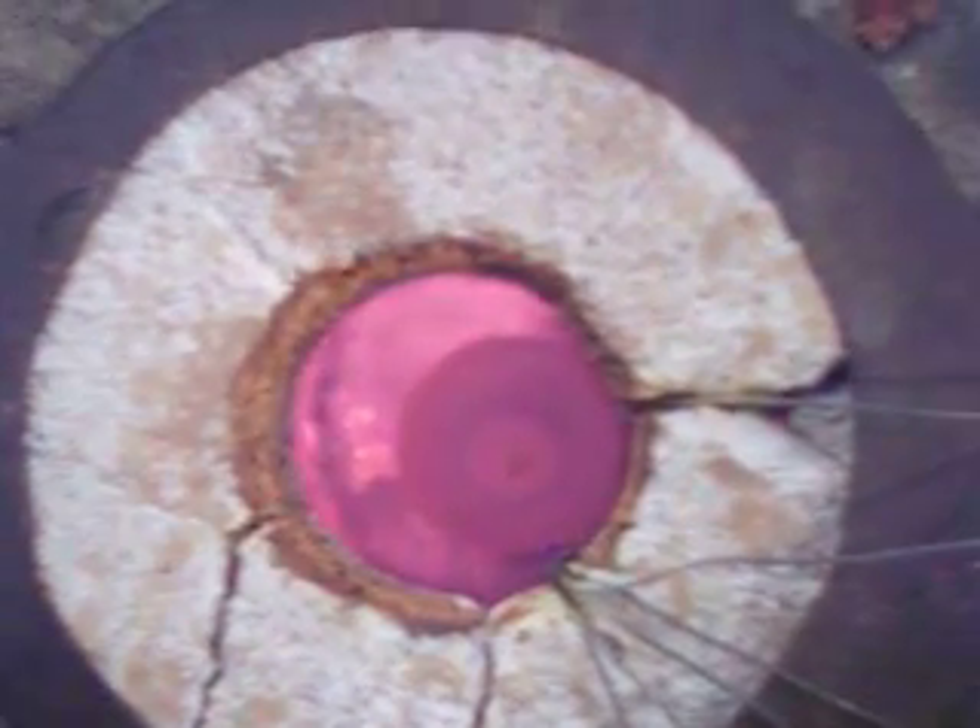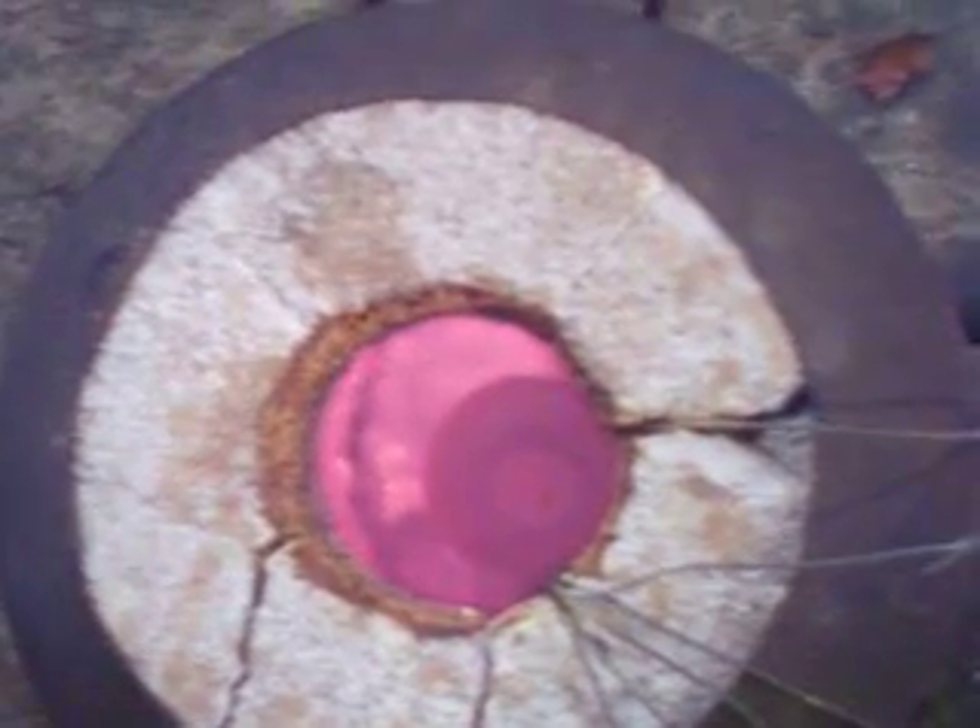This is what it looks like when the lead is being converted to litharge. All of the rolling stuff you see on that is the interference color. The darker stuff around the pool is litharge.